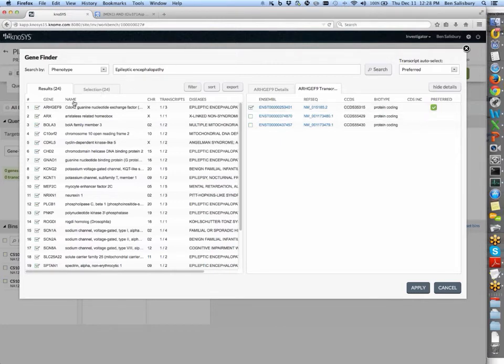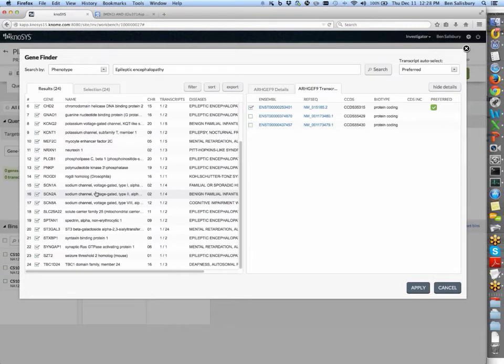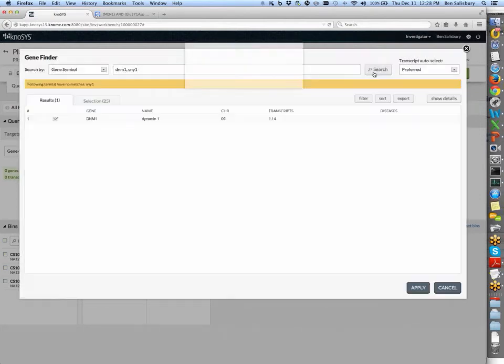this should do. The only problem is when I look down this list, I noticed that we're missing some genes. That is, we're missing genes that came out through the Epi4K study that Dr. Goldstein was involved in. So there was the dynamin-1 gene and the synapsin-1 gene. And we're not searching by phenotype this time, but by gene symbol. So let's do our search.